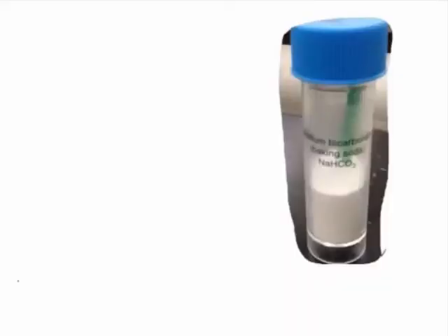In today's lab, you guys are going to be introduced to the chemical vials. This picture on the right here is an example of what the different chemical vials are going to look like. And I want to explain to you how you can read and better understand some of the information that's provided to you on the chemical vial.